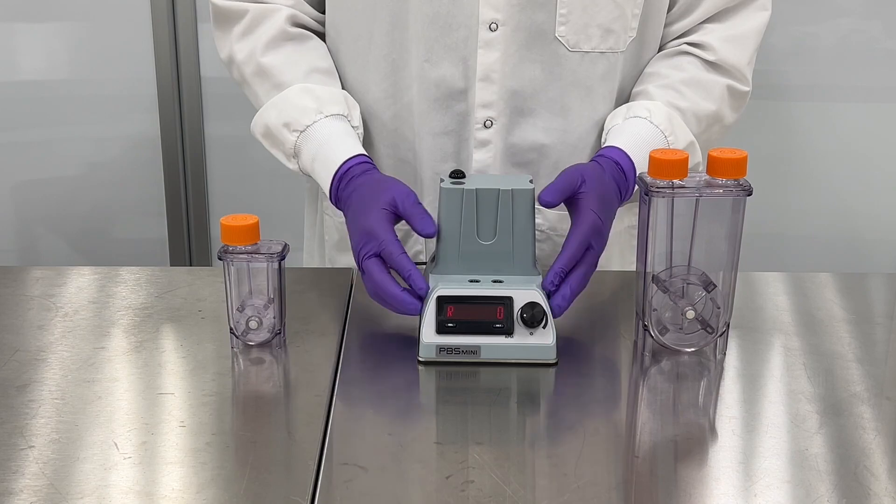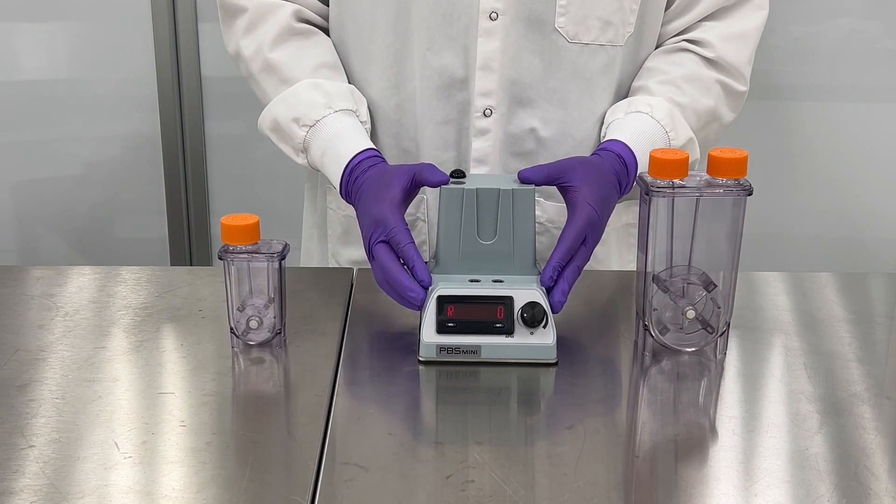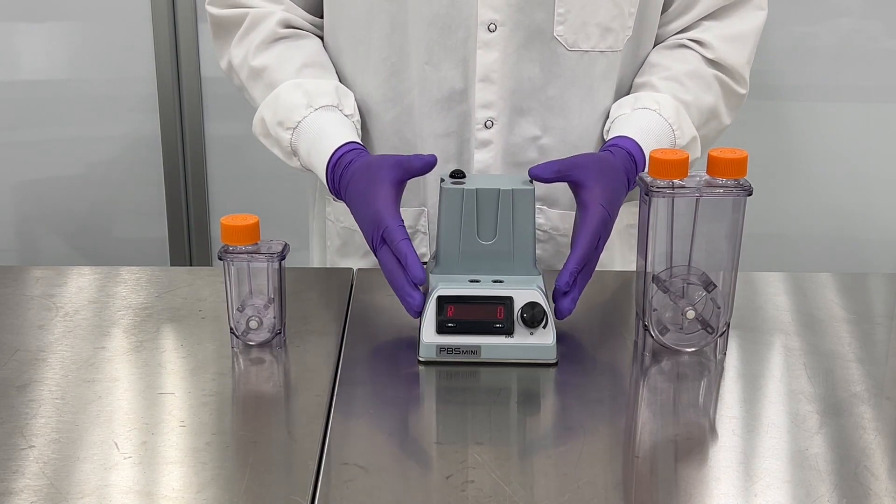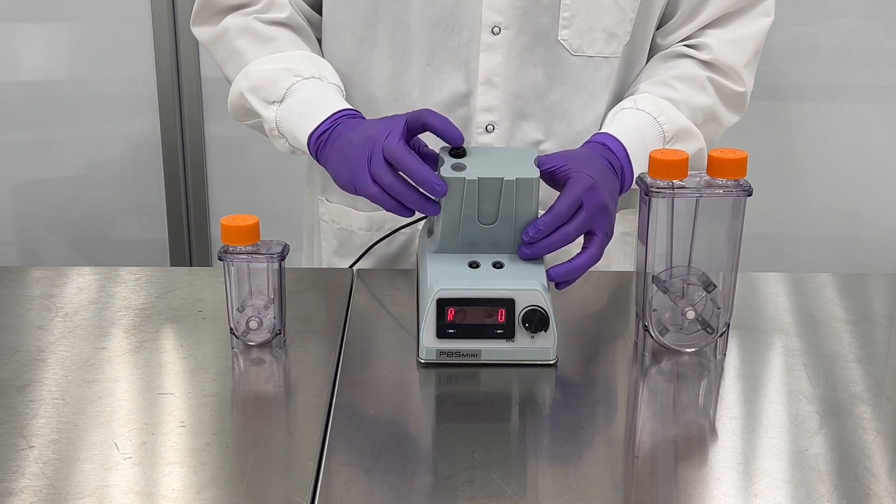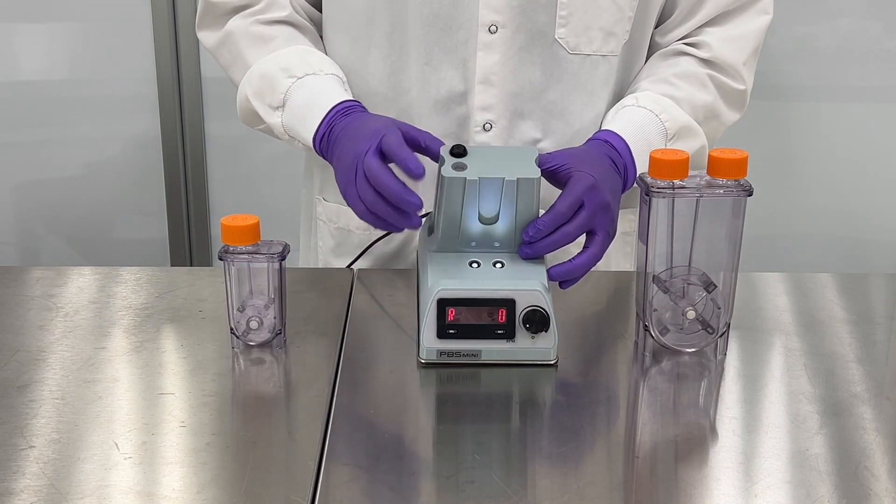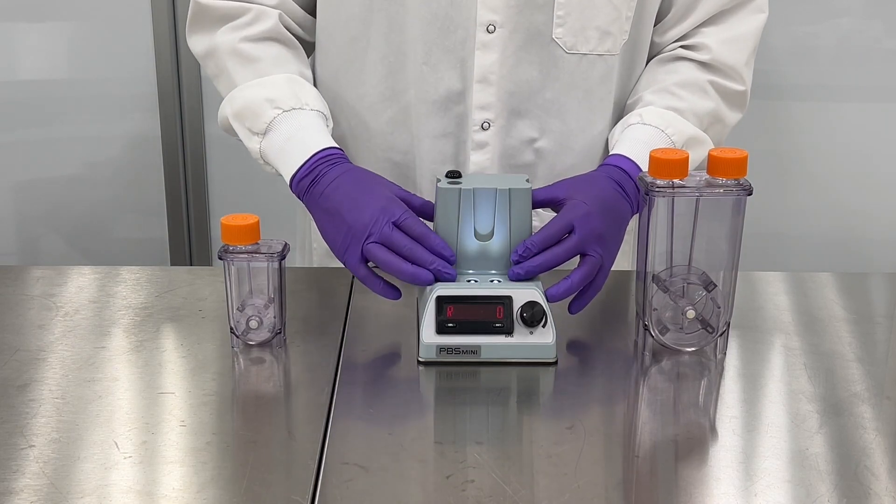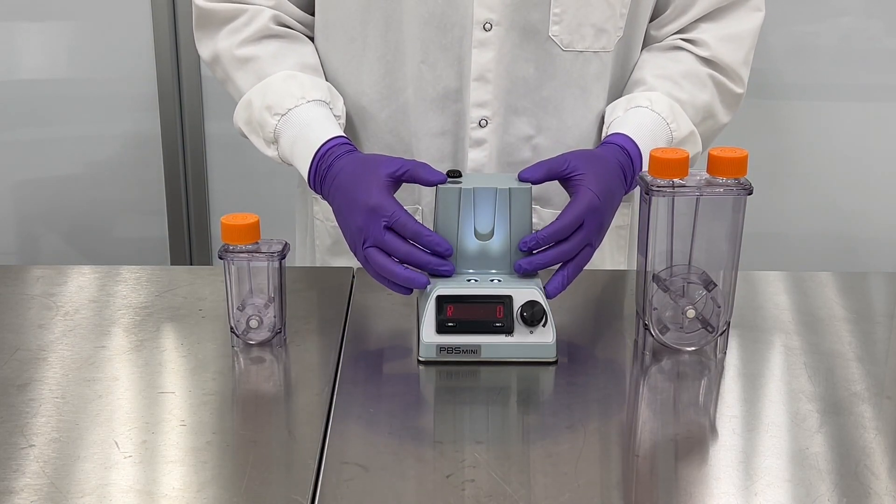Furthermore we have the body here so this is a chemically resistant plastic that's meant to be cleaned with 70% IPA or ethanol. We also have these little LED lights right here and the LED activation switch. So this will be for looking at it in the incubator or something like that.